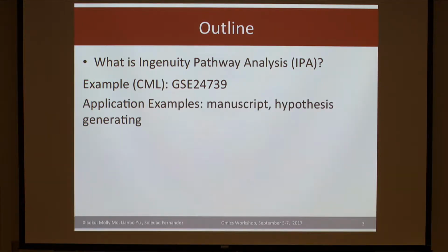Later, I'm going to give you application examples, including how to use IPA to help you write a good manuscript, and how IPA can help you with hypothesis generation.